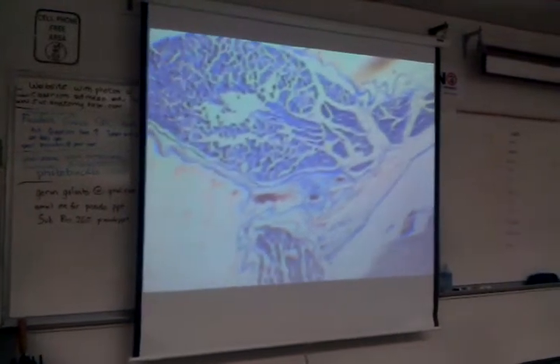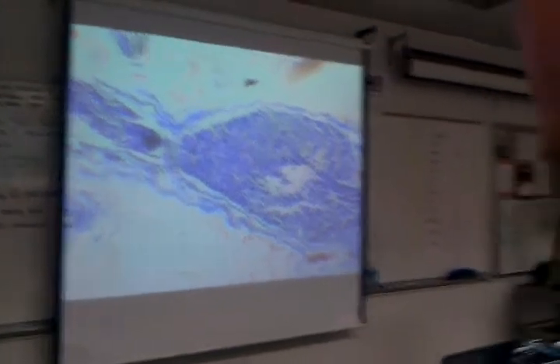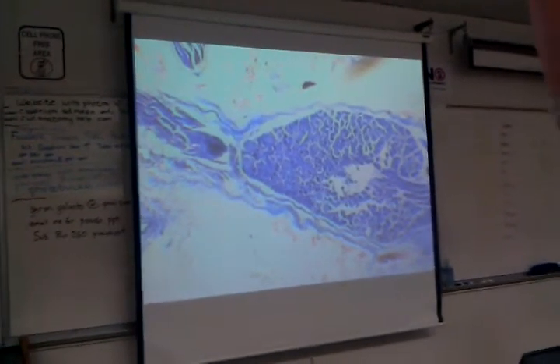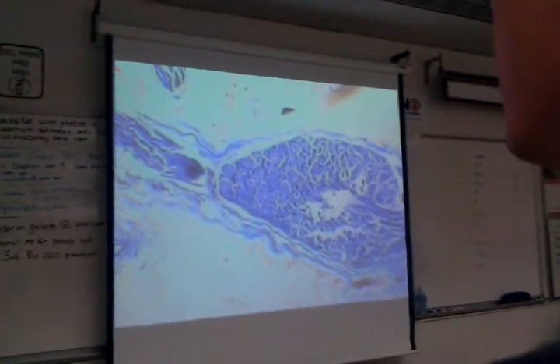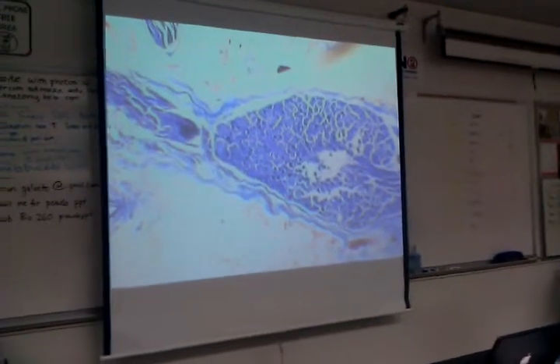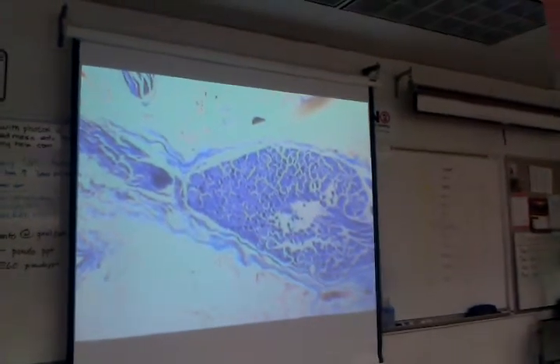Watch me here. So here's just a little bit of what's left of the incoming dorsal root. So sensory neuron axons come in through here and pass through here. Isn't that the dorsal branch? Right there, it's called the dorsal. Well, this is the dorsal root ganglia, right? This is the dorsal root. It's not the ramus. Okay, the ramus is somewhere else. The ramus is on the side. So it comes in through here, goes in through here, and then it's going to go into the cord.